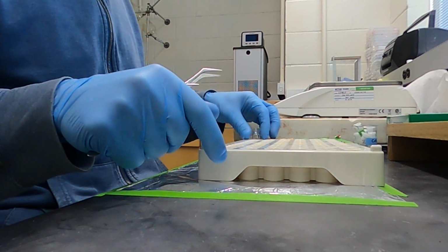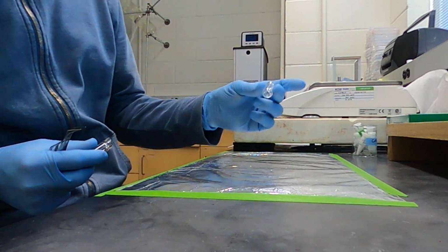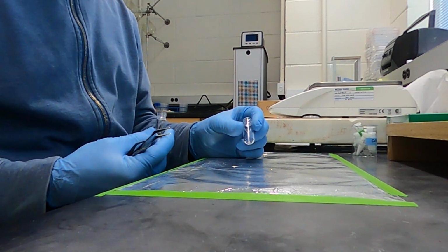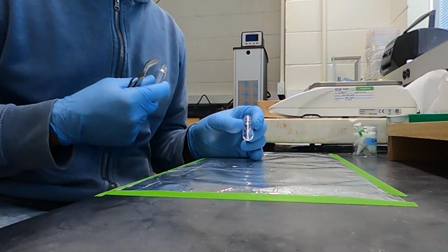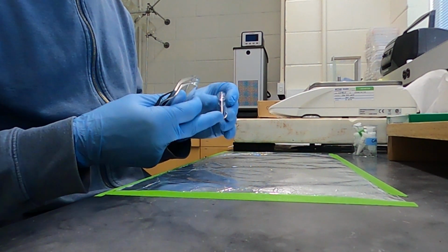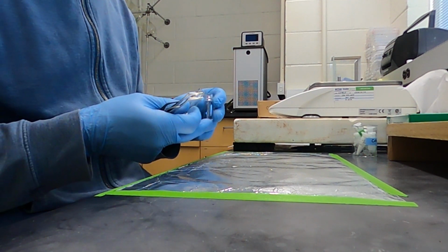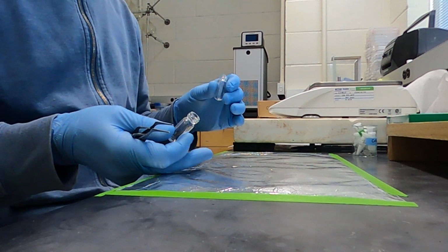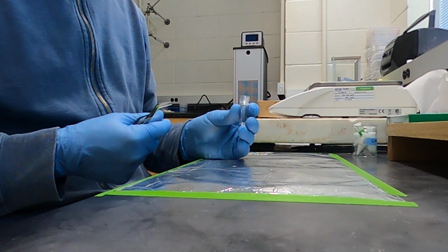So now how do we do this? Well, with my tray, that's the vials I'm gonna use. In that case, they're tiny vials because I have only 90 micrograms of material. For that measurement, it's better to work with 160, 180 micrograms of material. In that case, we use larger vials. These samples, the customers did not have enough materials to put in large vials. So to work with smaller amount of materials, I'm gonna use tiny vials.